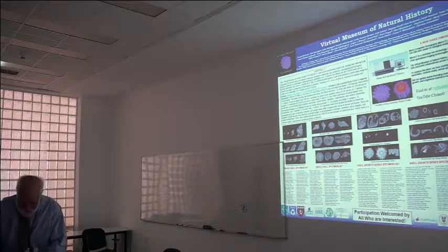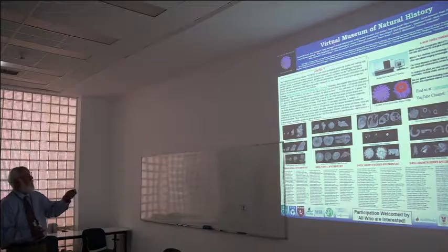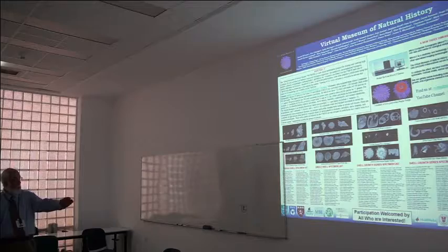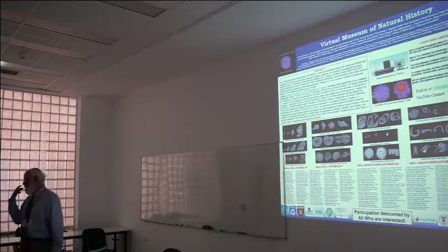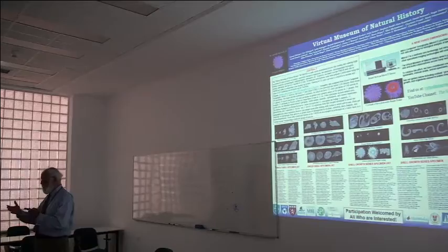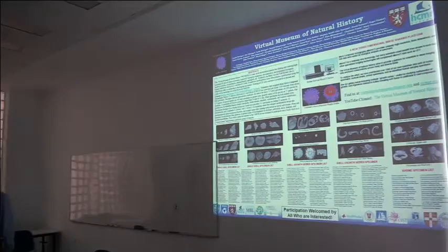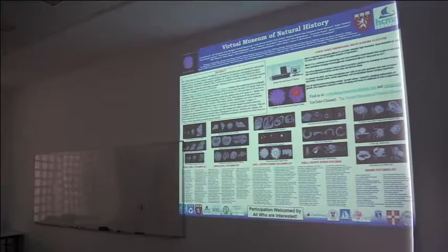Yes. So Thorsten Lang is a wonderful young scientist in Malaysia, who did micro CT imaging of a single genus of land snails. We've now done 200 genera, including, it's a bit hard to see because I didn't do such a good job, for example, Nautilus pompilius, we all know about nautiloids. The largest study was just carried out last year on about 20 specimens from 5 centimeters to 25. We now have 10 millimeters to 28 centimeters. That study was with a clinical machine that gives millimeter resolution. Our images are with this machine that gives micron level resolution, a million times higher resolution.